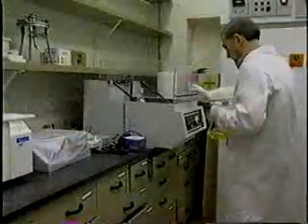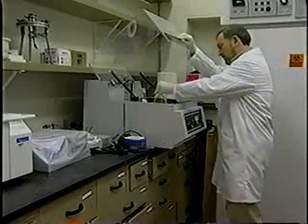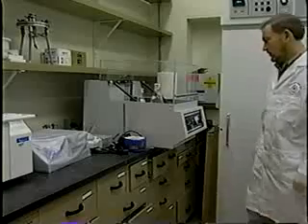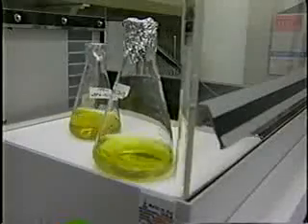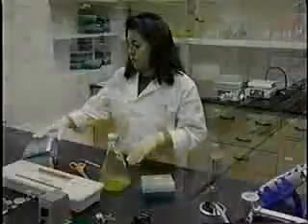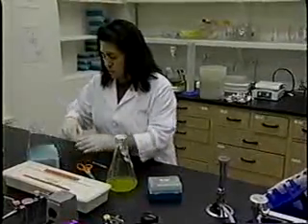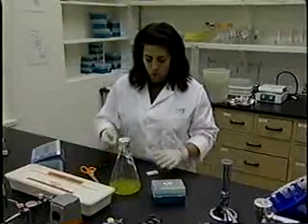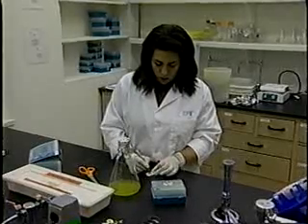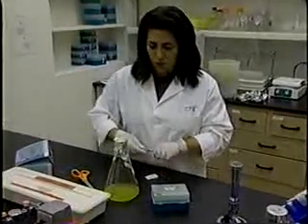The laboratory should be staffed by personnel with training and experience in analytical microbiology techniques and handling of pathogens. The laboratory should periodically run positive controls to ensure that the tests used are capable of detecting pathogens when they are present. This can be done by adding a known quantity of pathogens to spent irrigation water or sprout samples and then testing these positive samples.